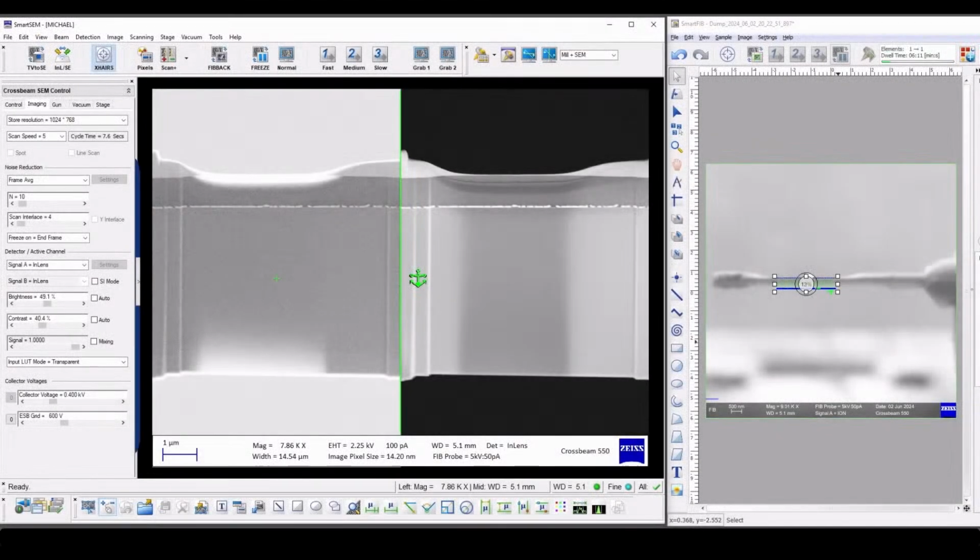That way we can keep track of where it's thinning, partly because the structural integrity starts to degrade if you don't make the window narrower. So ideally around 3 to 4 microns wide maximum is what you're targeting. Anything wider than that, you kind of risk the TEM lamella bowing or doing strange things.